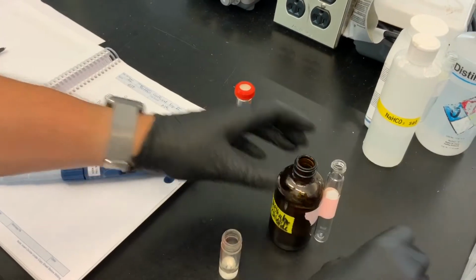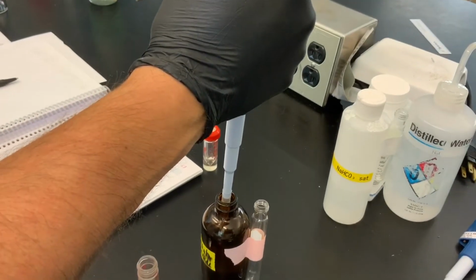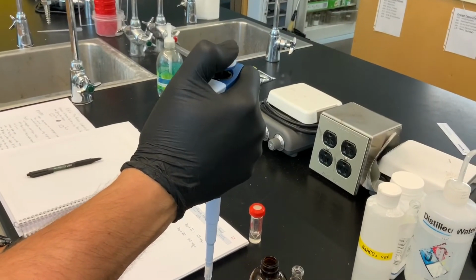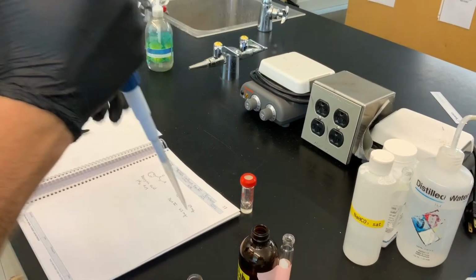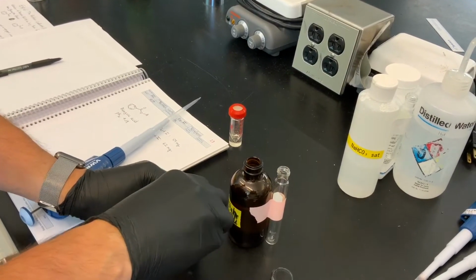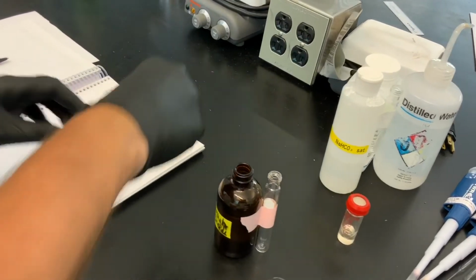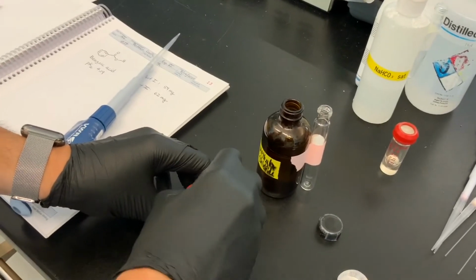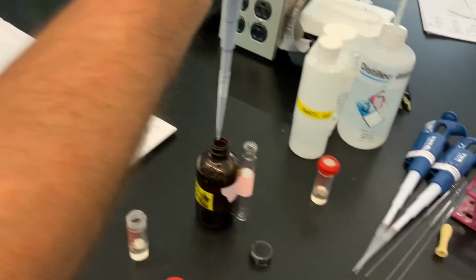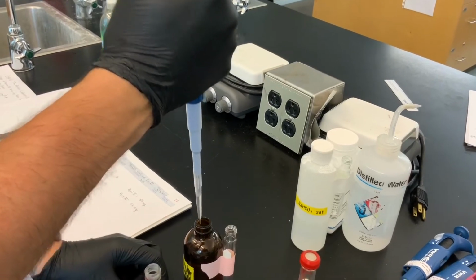So methylene chloride bottle. Remember, there's 2 levels of depression here. The first, just slowly draw up the 600 microliters, and then delivering. And so we'll let that larger piece of benzoic acid dissolve in the methylene chloride as we perform part 1. And then here was our 5 milliliter reaction vial with the 59 milligrams of benzoic acid. And I'm going to add 600 microliters to this one as well.